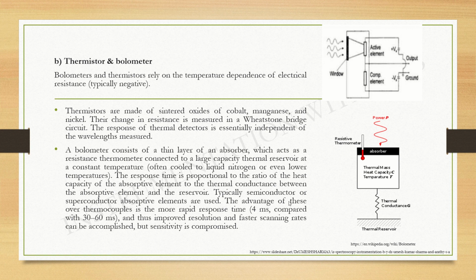The advantages of using these over thermocouples are that the response time is less, resolution is improved, scanning rates are faster, but the sensitivity is low as compared to the thermocouples.